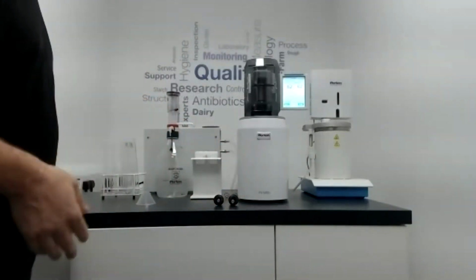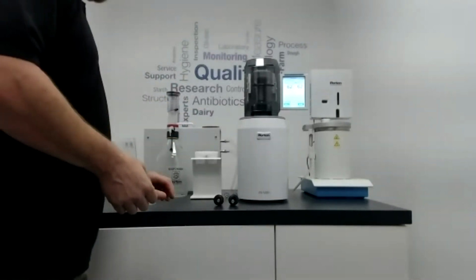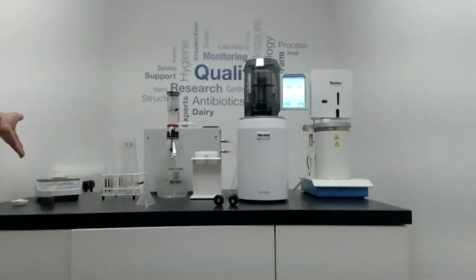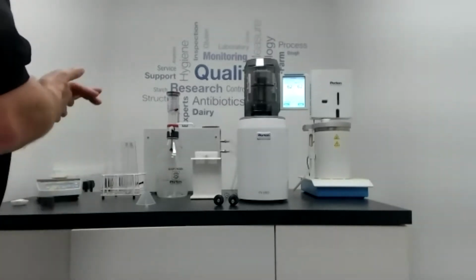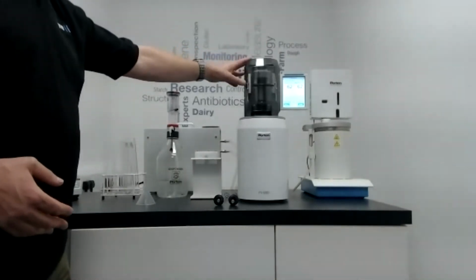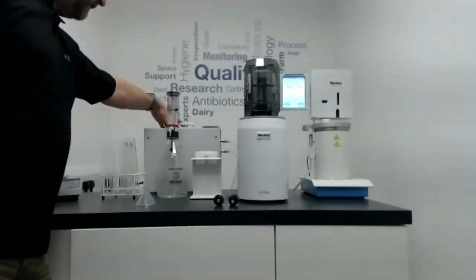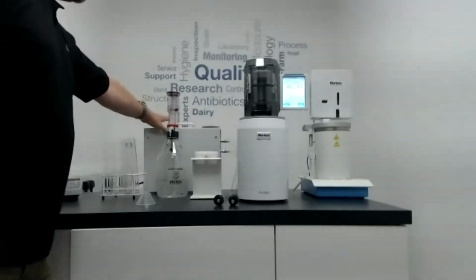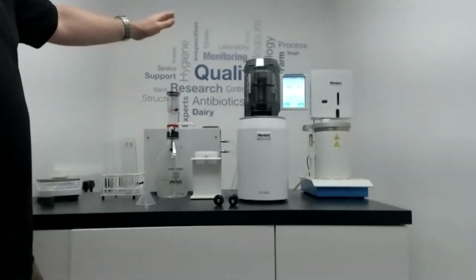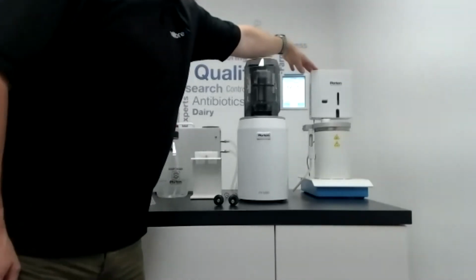Okay, good morning. So we're just going to run through how to do a falling number test. I've already pre-weighed 2 samples of 7 grams of ground wheat, and we'll just run a duplicate test. You can see we've got the falling number 1000 piece of kit here. We've connected it up to a recirculating chiller bath, so that we don't need to have it connected to the cold water supply. And just to show you, this is the single instrument doing single tests, the falling number 1310.